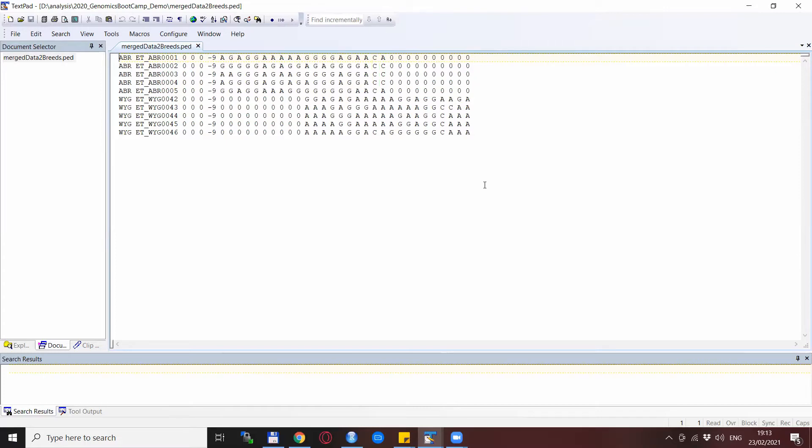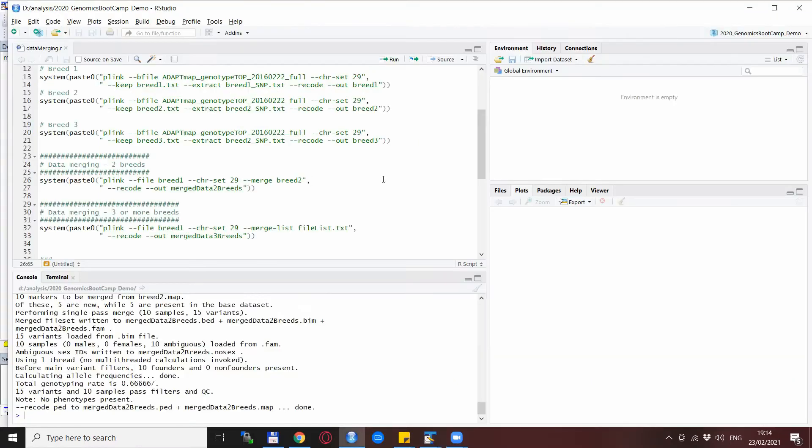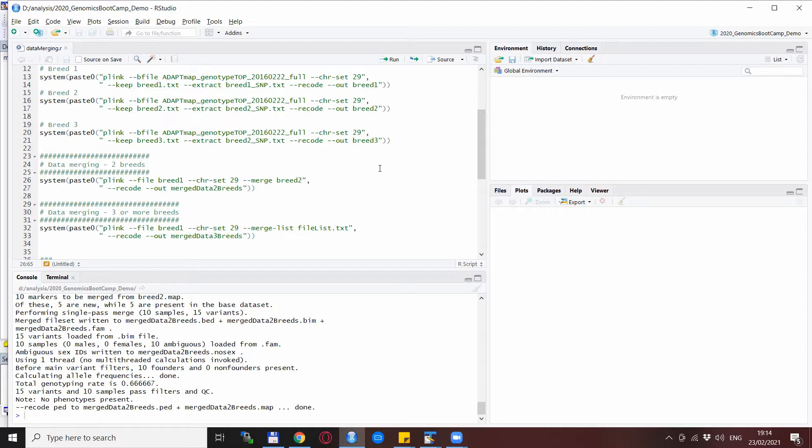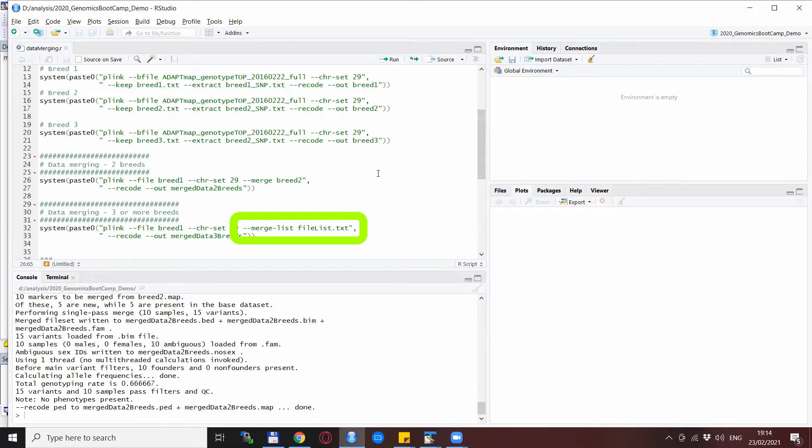So this is in general what you can expect when you are merging two datasets that are not totally overlapping in terms of SNPs. Another fairly frequent occurrence is when you need to merge more than two files. In this case you don't want to merge one by one because imagine if you need to merge 100 data files, of course you don't want to copy-paste a line 100 times. So for this reason and for this purpose you can use the --merge-list statement.